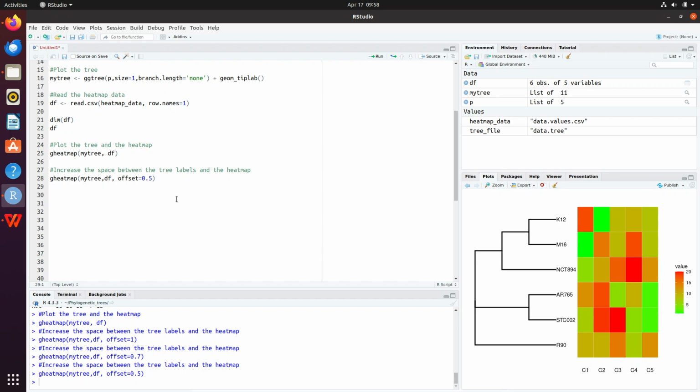All right, now it's time to proceed. So what we are going to do next is this. Now, if we take a look at this heatmap tree, sometimes your text, or let's say the labels, may be longer than this. So what it means is that you may have to change the angles for the columns.